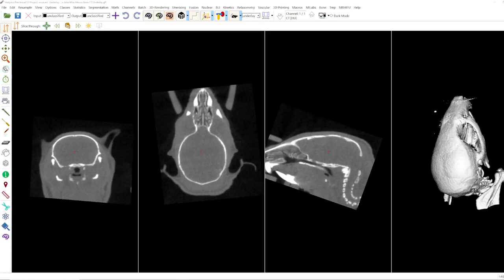Hello! In this video I would like to explain the mouse brain module of the Immolytics Preclinica software. You can find it here on the bottom of the mouse brain toolbar on the left side.